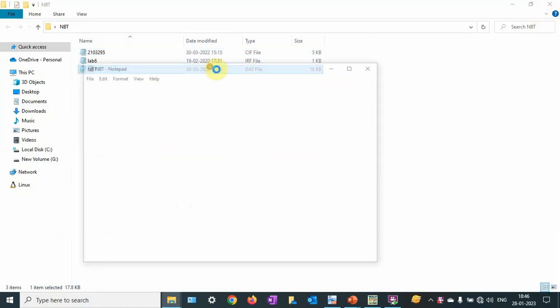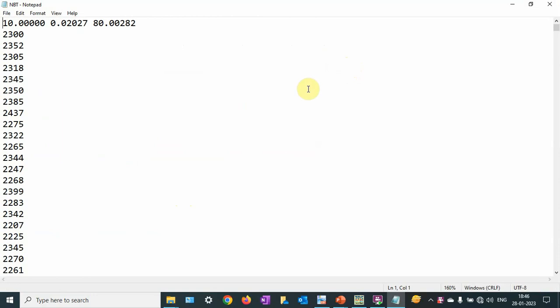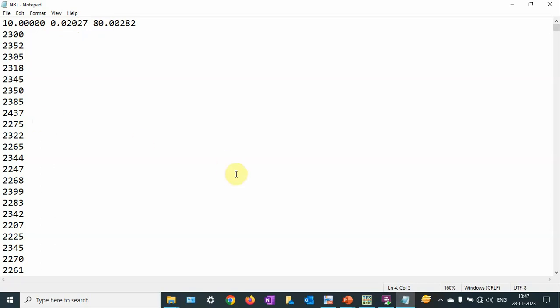Then we have our data file. You can see this is the initial 2-theta. We have collected the data from 2-theta 10 to 80 degrees. We have initial 2-theta of 10 degrees, then the step — the distance between two data points — and then the final value, followed by the intensity data. It is important to take the data very carefully: use a very slow scan rate and a very small step size. You can go even 0.01 or 0.005.